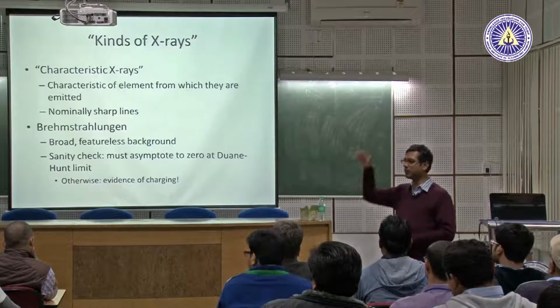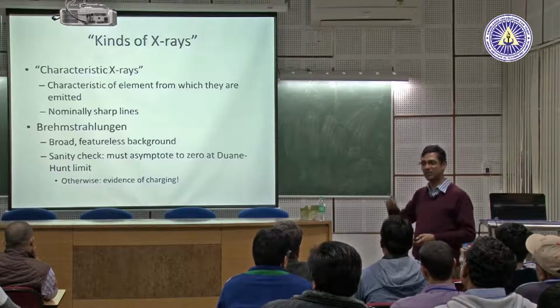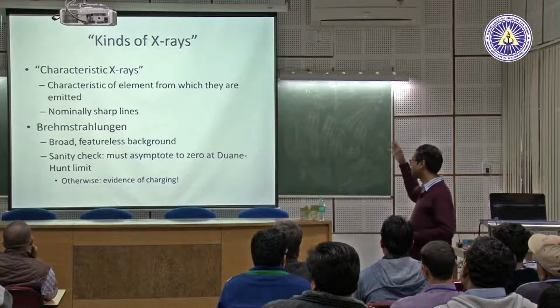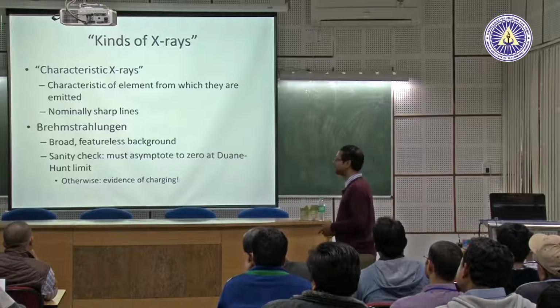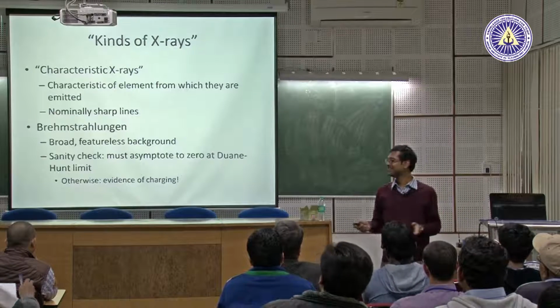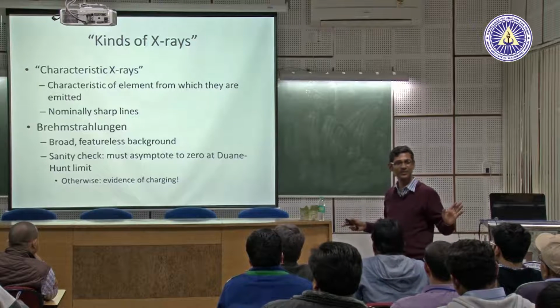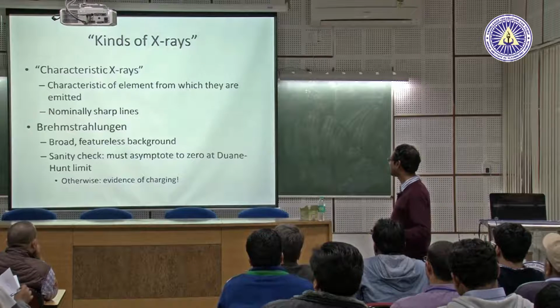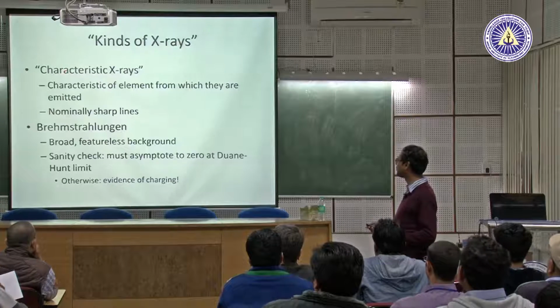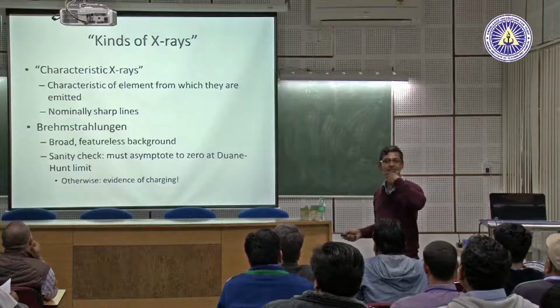The first thing you do is put the sample in the electron beam, and then you get the whole spectrum, right? All the lines, the energy peaks, and then you can generate that. And this has already been taught, I don't need to teach it again, right? The difference between these is known. X-ray diffraction. Okay. Which one was discovered first, which one was first seen by Roentgen?